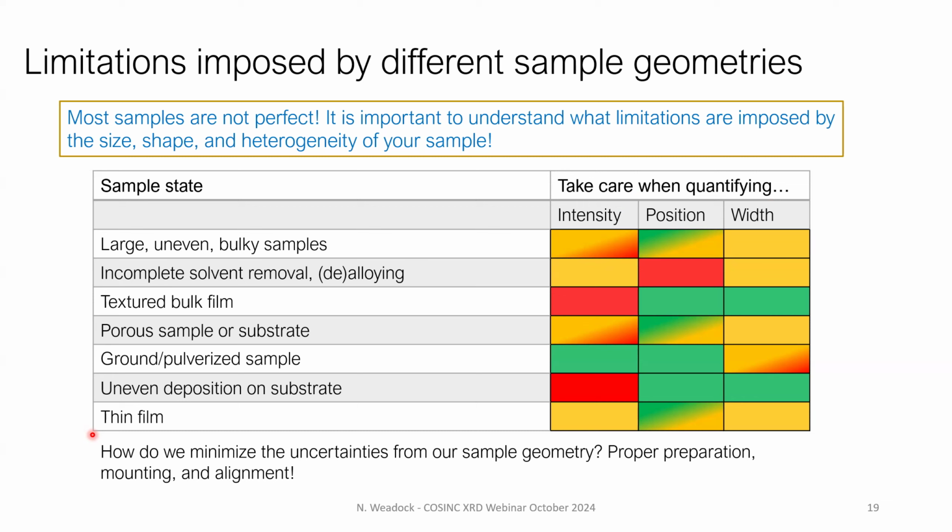So here I'm showing different common sample geometries and sample states, and what parameters of the measurement you can trust will be pretty accurate or maybe not so much.